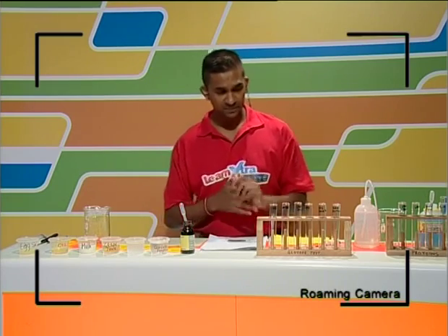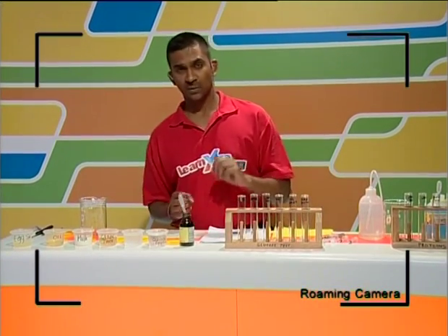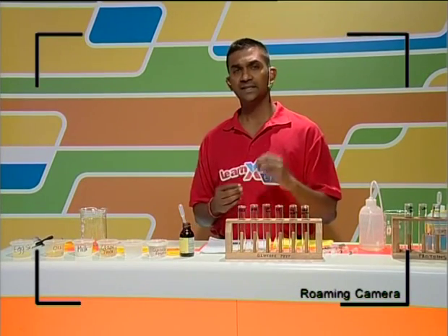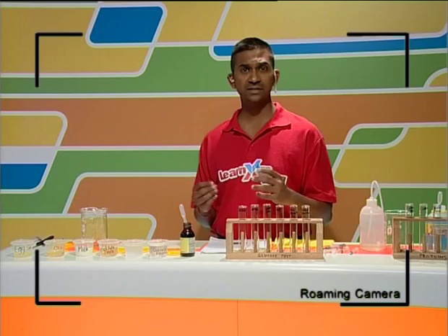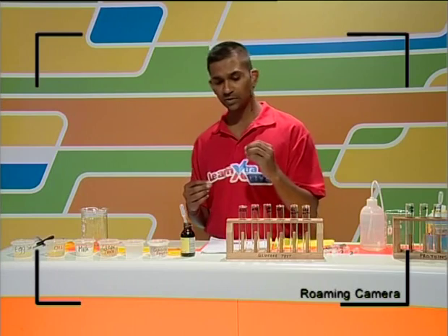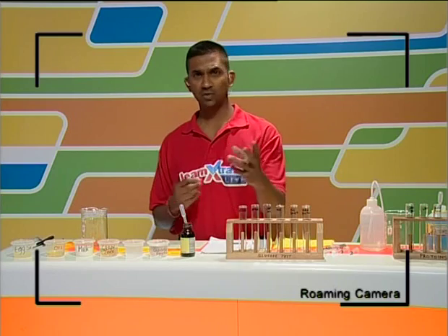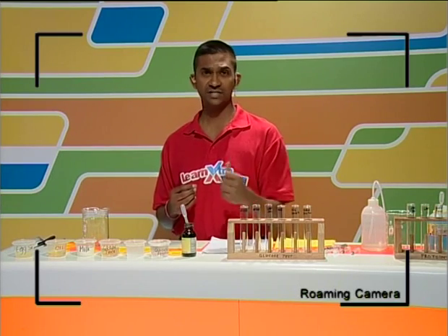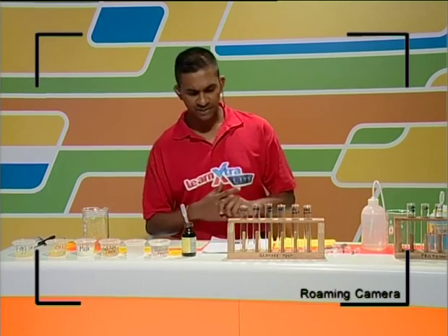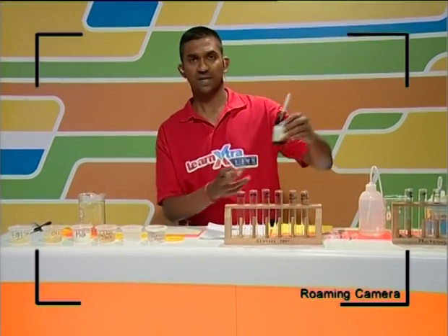So let's start. Today the first test we're going to look at is for the testing of glucose. And guys, when we test for the presence of organic compounds, we need to have a reagent. A reagent basically is an indicator. It's a mixture of a few chemicals that will react with the chemical group and produce a color. Essentially what we're looking for is the presence of a protein or an organic compound, and that could be indicated by a change in color or by the absence of a typical color. So when we look at any food test for glucose, we normally test for the presence of glucose using a reagent known as Benedict's reagent.